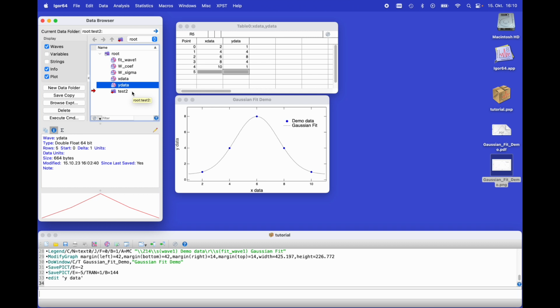In the practical application, usually I have, for example, measured different samples, and if I want to have them in one Igor experiment, I have a data folder for each sample with the sample name as the folder name and sort my data into different data folders.